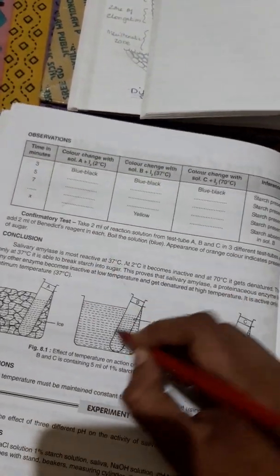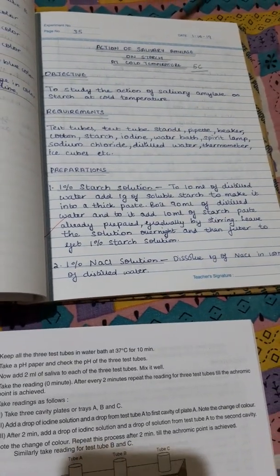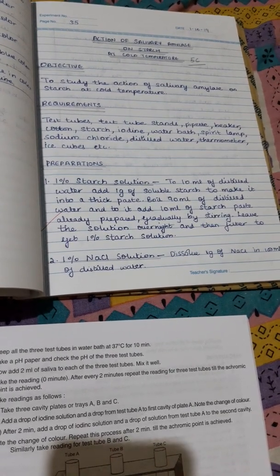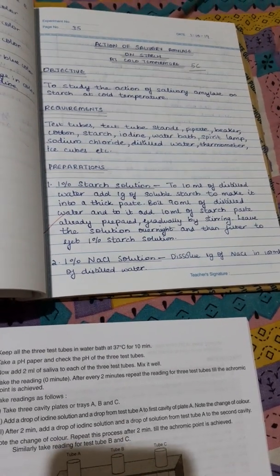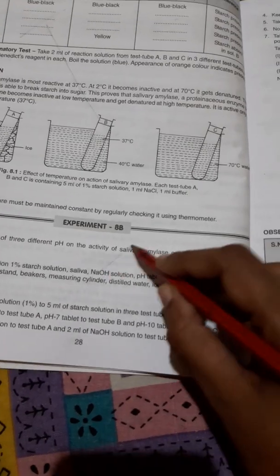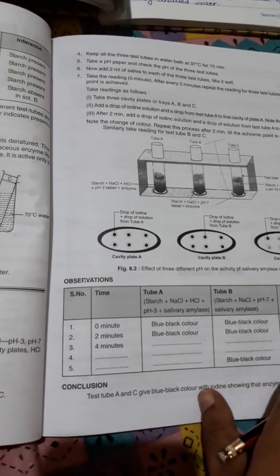Okay, so please don't write this experiment from our lab manual. Instead, I will add these photographs in our note session. The activity at normal temperature, at high temperature, at cold temperature, we have to write. Then no need to write activity of salivary amylase on pH, because we are opting only different temperatures according to the revised syllabus. Okay, children.